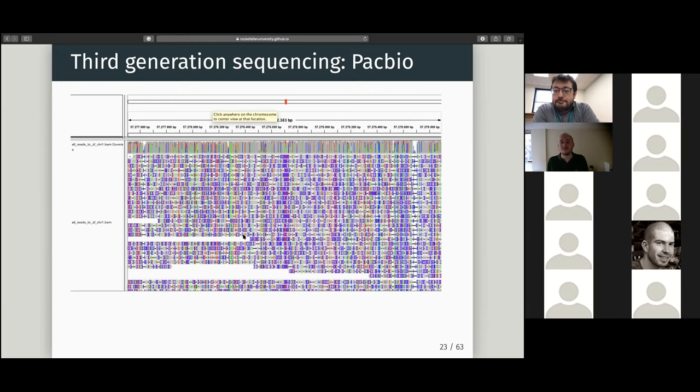We showed people how to visualize BAMs like this in IGV. So hopefully they remember. But maybe with less density than this. They're nice short Illumina reads. Illumina reads will look much, much cleaner than that.